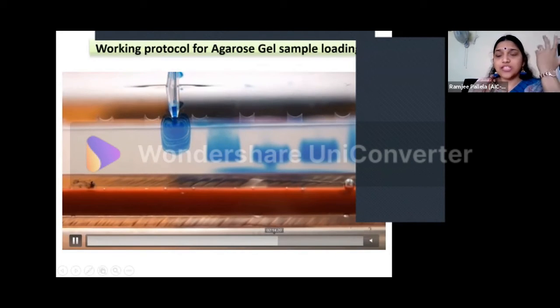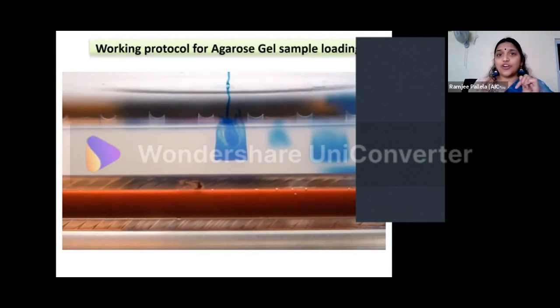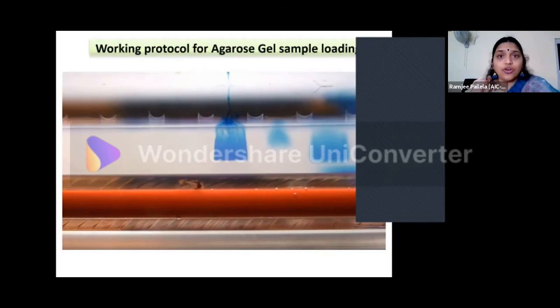Sometimes it may come out like this also, but don't worry about it. You may be losing a little sample, so it is better to be careful, because when you lose the sample, you may lose the fluorescence as well. So when you are checking, although the expression level will be the same, the amplicon will be the same, the sharpness of the band will vary. This generally we do when we are checking the effect of any compound, as I told you. So concentration dependently, if the compound is having some changes on the DNA, that we see through the fluorescence only, through the amount of DNA that we are amplifying. But if because of your mishandling, it did not come out, you will be having a wrong result or a false result. Okay, so this is how you add the samples.